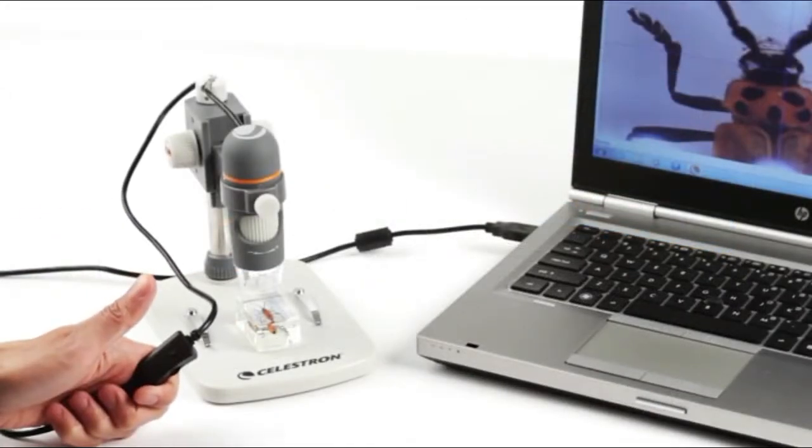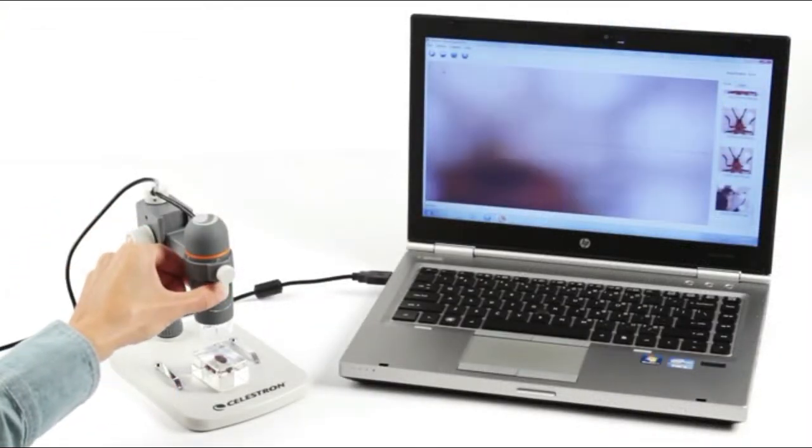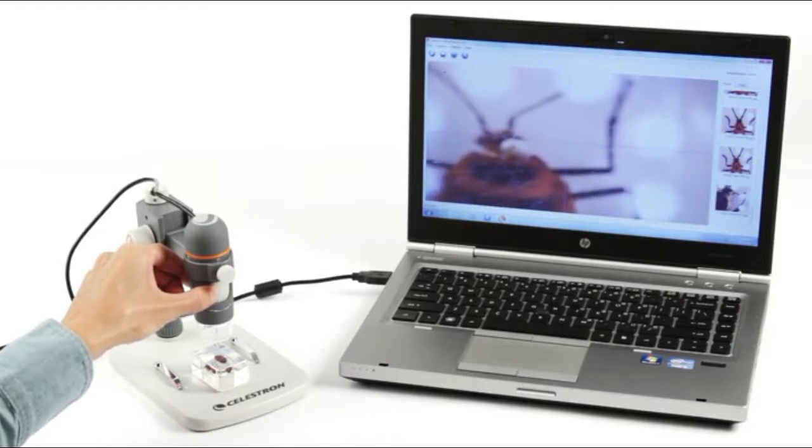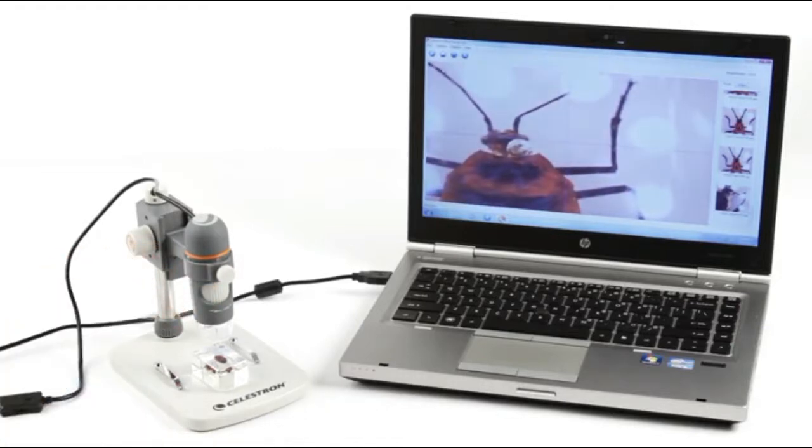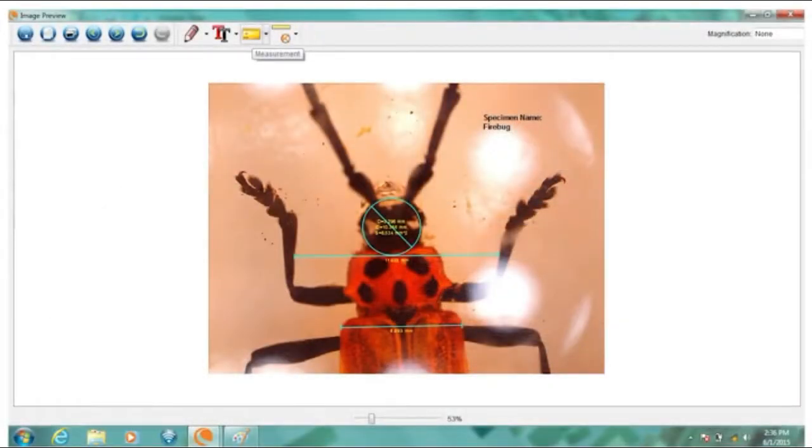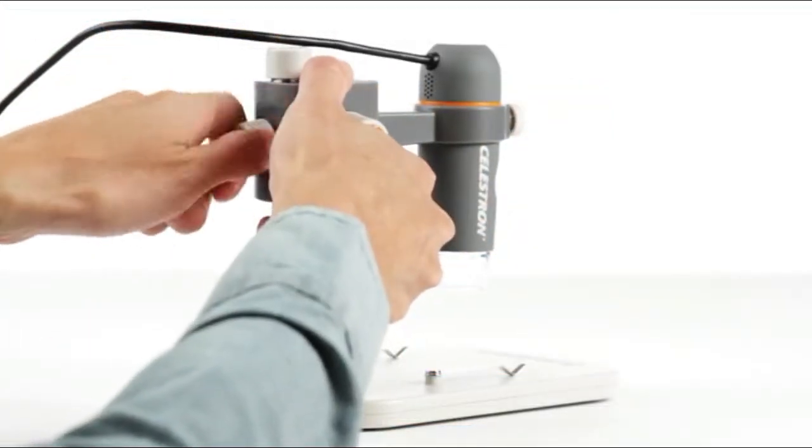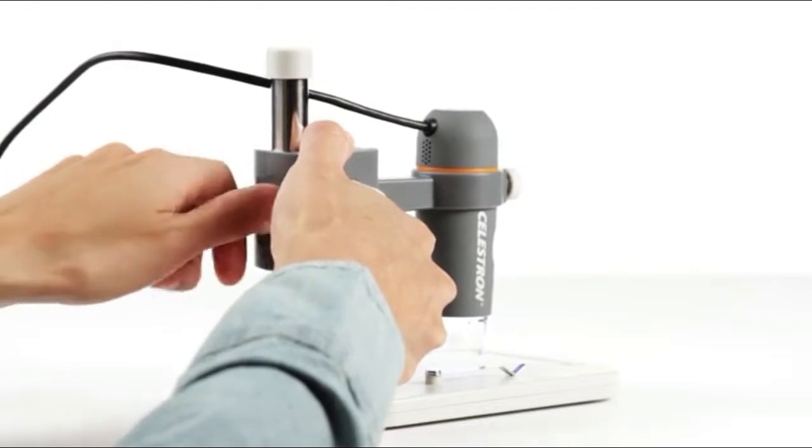Included micro capture Pro software for Mac or Windows based PC is a powerful tool for capturing high-resolution images, VGA video, time-lapse animations, and more. Plus you can measure the size of your specimens, make notes and save images directly to your hard drive. Another great feature only available with the handheld digital microscope Pro is the easily adjustable sturdy stand.